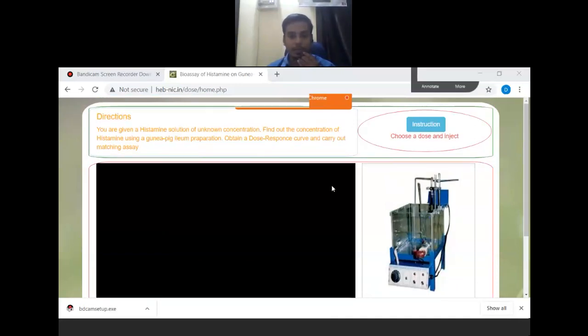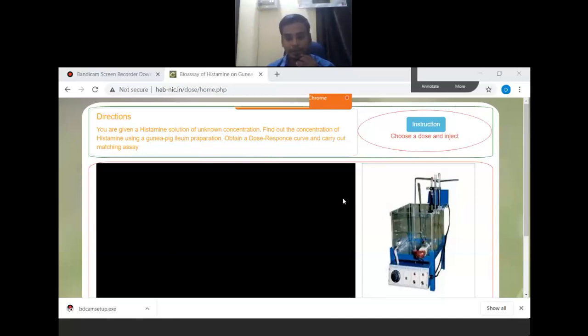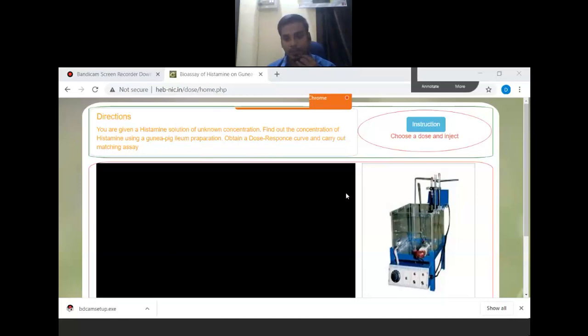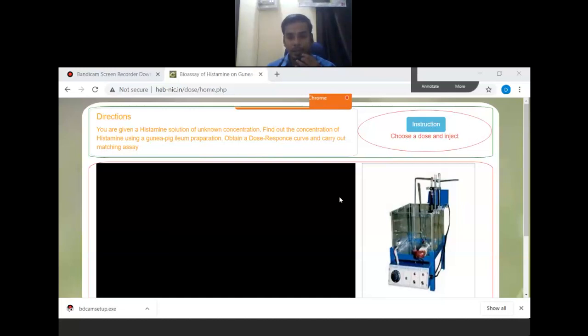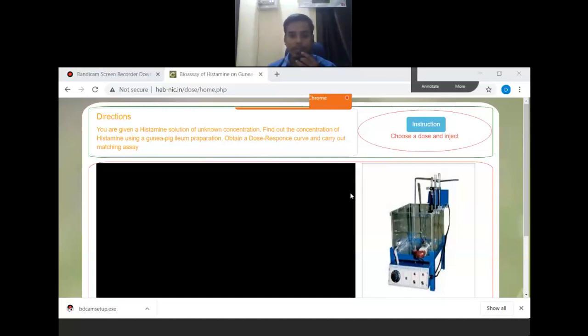This is the instrumental setup. We will have a student organ bath. In this tube, we have to attach the tissue or organ. We will put the activity. This is a water bath which maintains a constant temperature within the chamber.